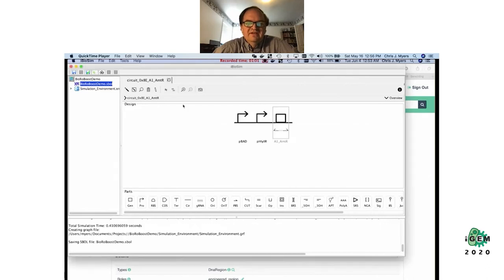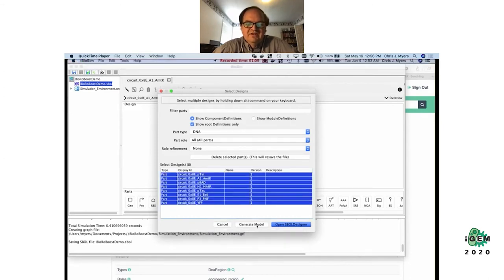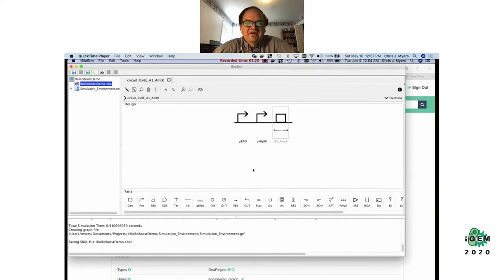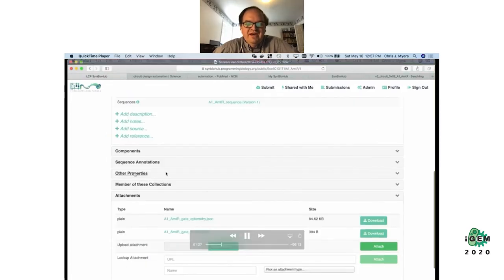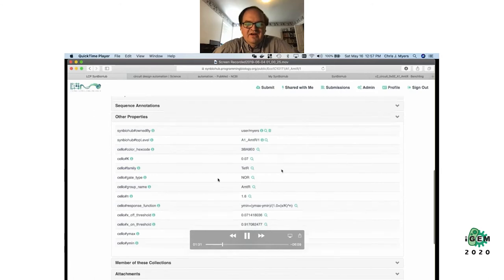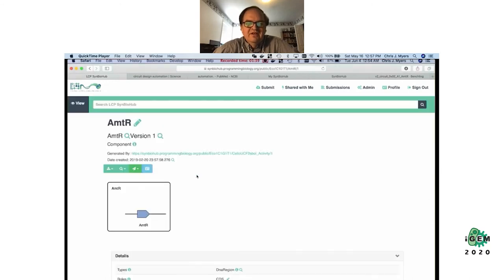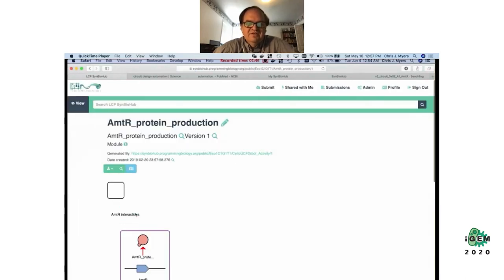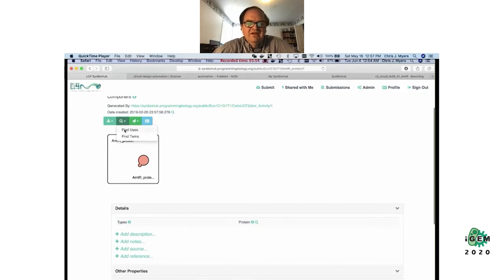Now I want to build a computational model for this circuit composed of several transcriptional units. I'm asking it to build a model of the 0x8E circuit from that Cello paper. It's fetching from SynBioHub all of the part information — data like various on and off rates, the maximum and minimum flux of each part using units called Relative Promoter Units, all measured out of Chris Voigt's lab at MIT.